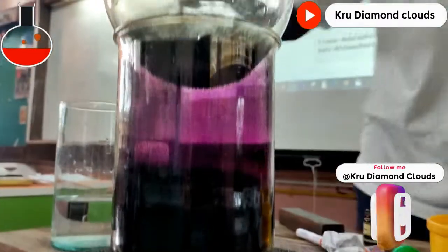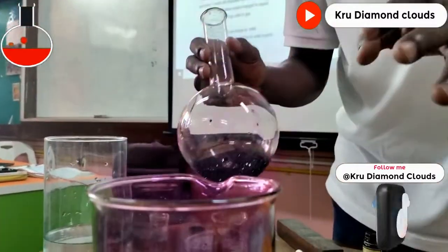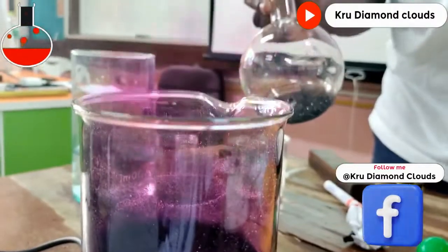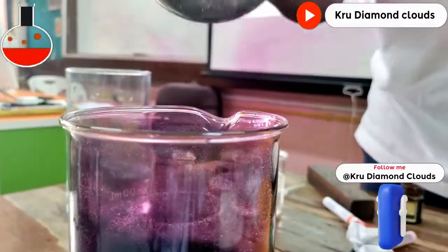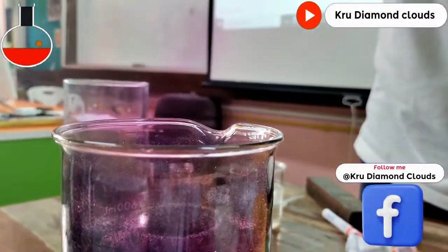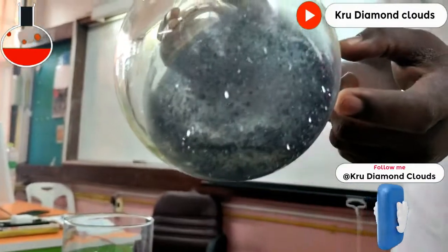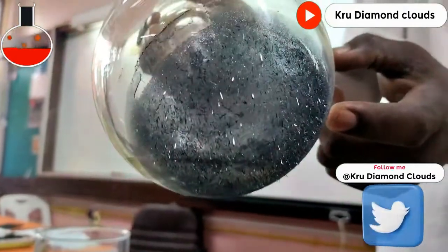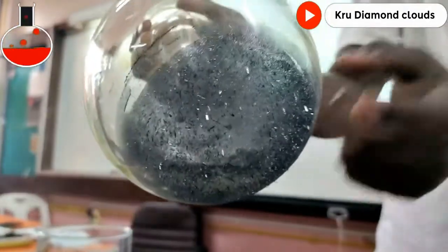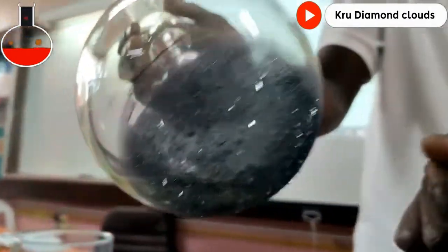Gas. You see our results. Sublimation: solid to gas, solid to gas. Iodine crystal changing to gas — it's sublimation. And this is deposition. The gas has now changed into crystal. This is solid crystal. You can see it here. This is called deposition.